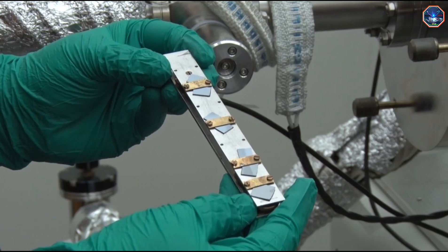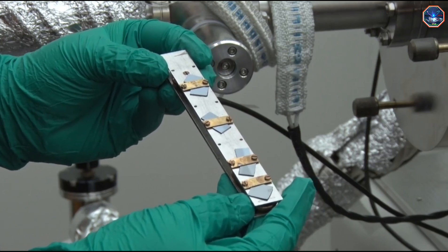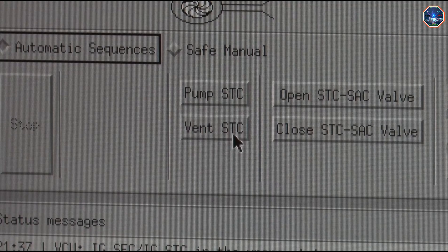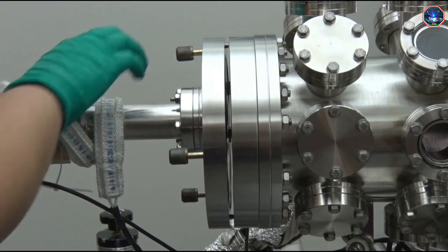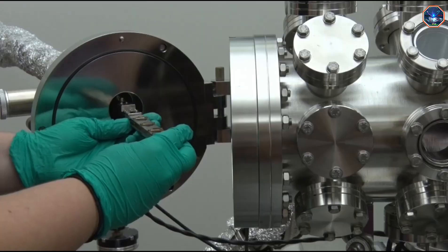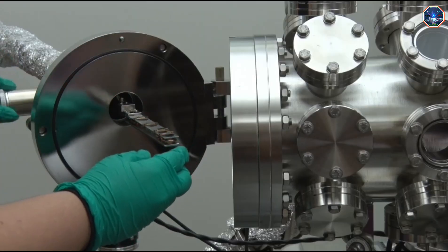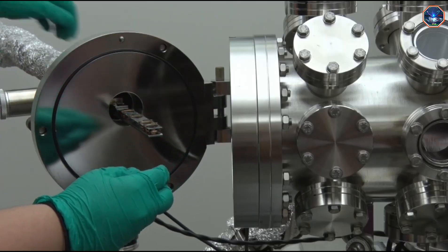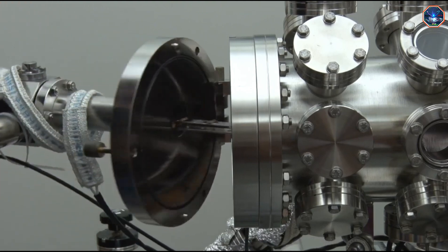Now let's load the samples I prepared earlier. First I'll vent part of the chamber to atmospheric pressure. After a few minutes I can open the door to the chamber and load my samples onto a transfer rod. Then I can close the chamber door and re-pump the system.